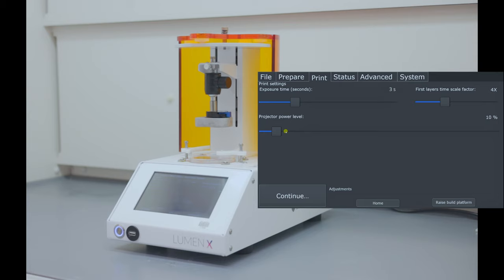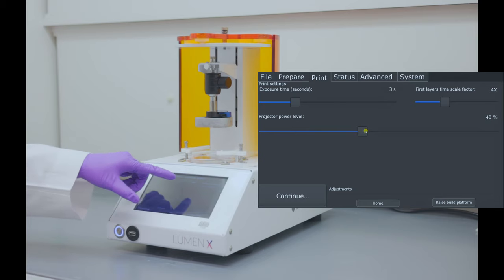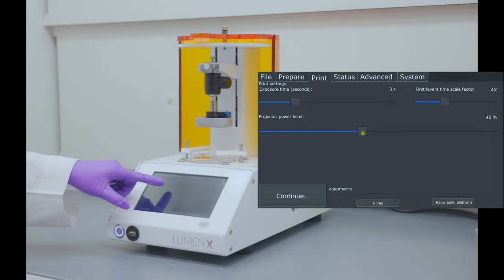We have a calibration sheet for this printer, which translates the percentage power to absolute units. So, we can adjust the power to be at 40%. We have changed the exposure time as needed, and the first layer time scale factor and the projector power.